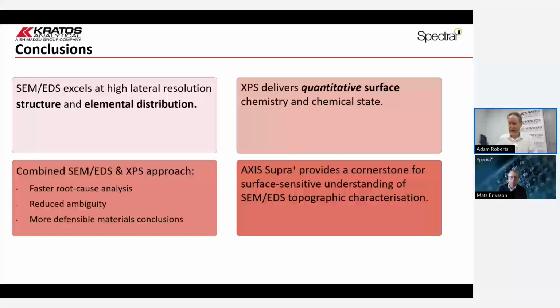Yes, and that's the challenge, because a lot of the assumptions, relating to the relative sensitivity factor and the transmission function, a lot of that quantitative nature of XPS assumes that the sample is uniform laterally.